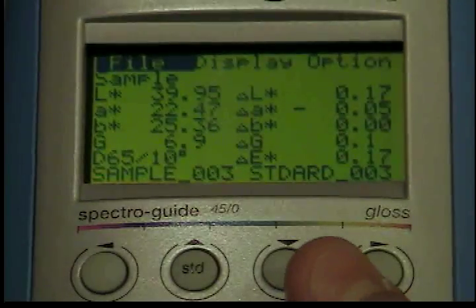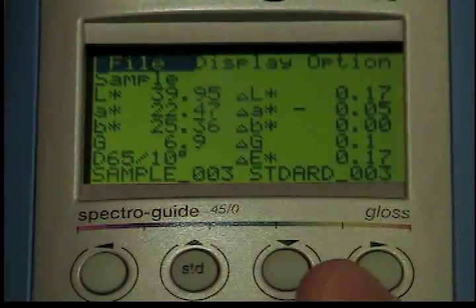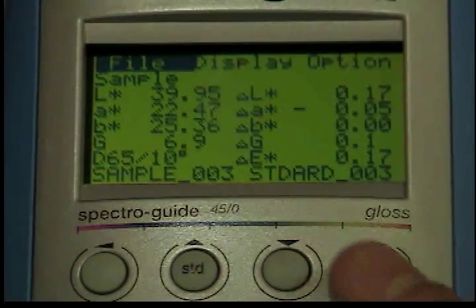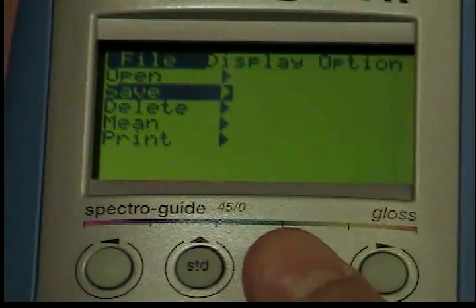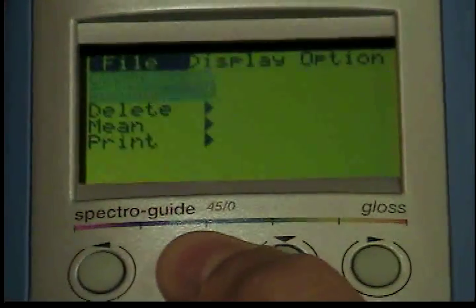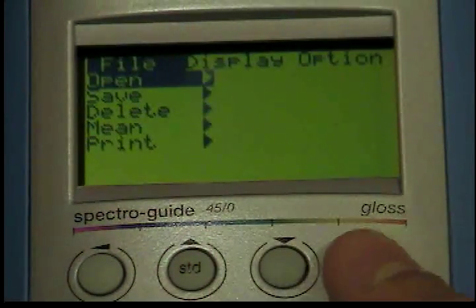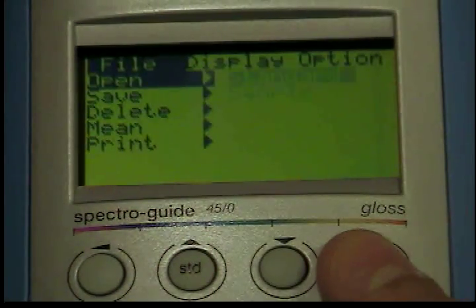Opening. From the file menu, use the down button to move the cursor to open. Press the operate button. The submenu will open.